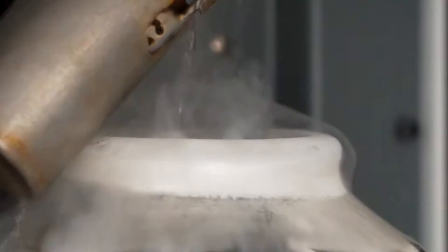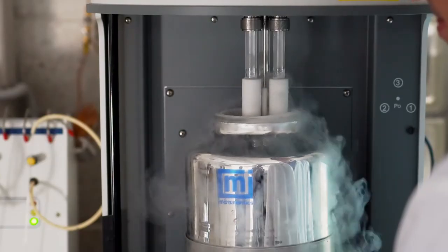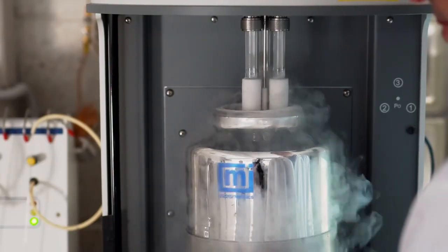Samples can be pre-treated to avoid agglomeration phenomena by means of PT device working under inert gas conditions.